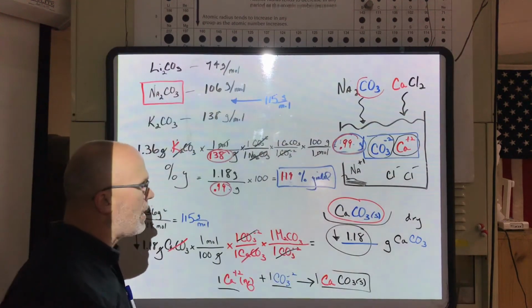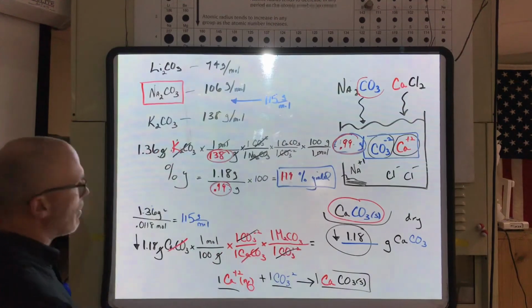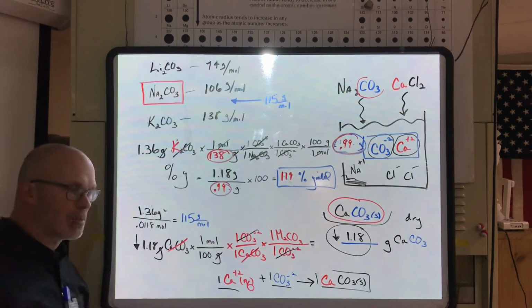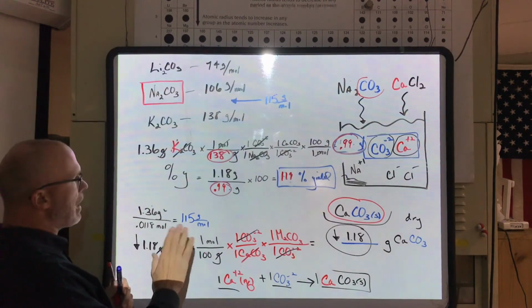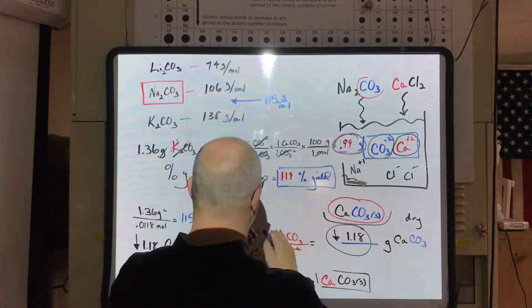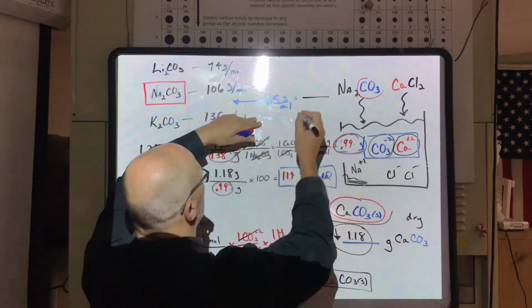All right. So in any case, let's go back and talk more about these errors, okay, that could affect this lab. And I want to finish this off this way. All right, so we have definitely established that sodium carbonate is my compound. Okay, let's talk about some other errors. All right, number one, let's talk about the fact that the major player here is our molecular mass. And we know that molecular mass was due to, okay, the grams that we got. In this case, it was 1.36.